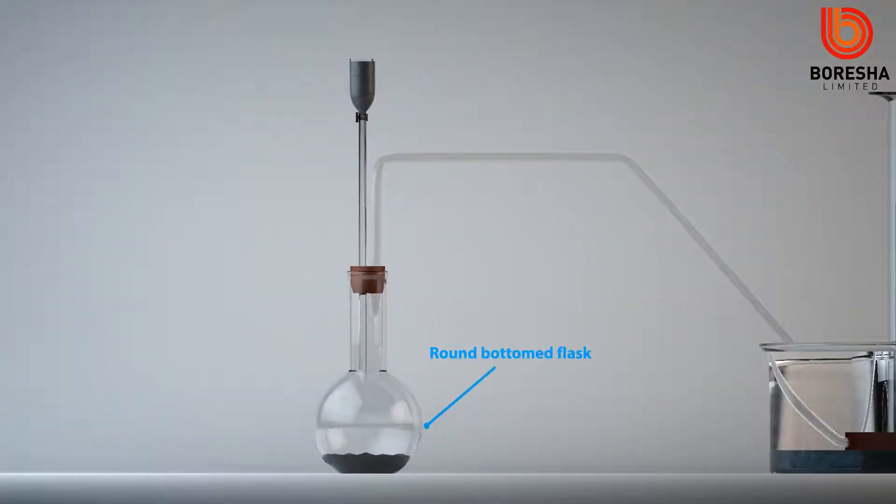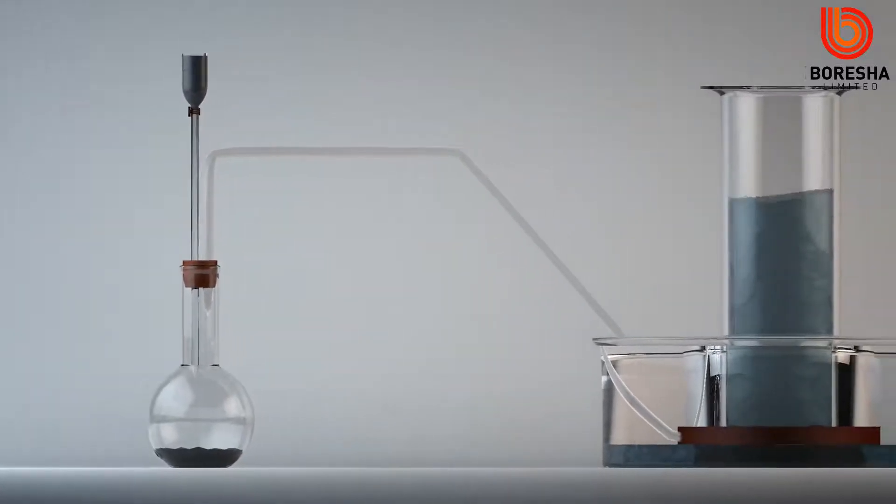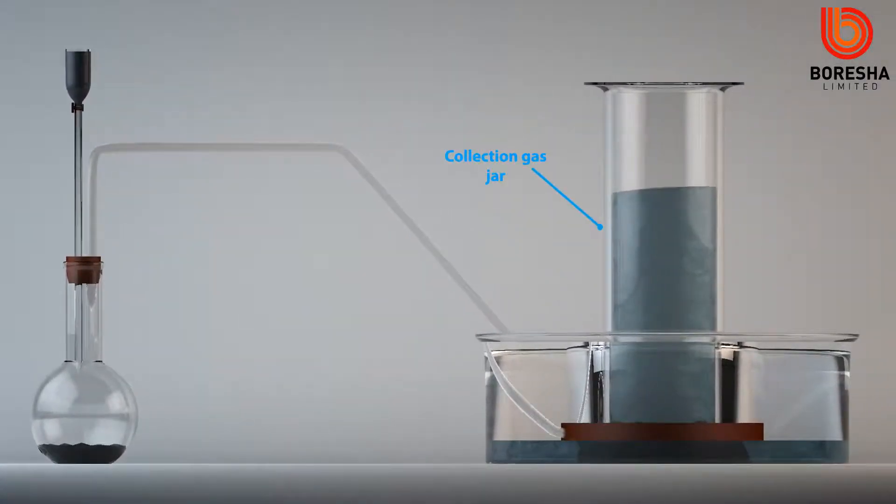Round bottomed flask in which there is a dropping funnel containing hydrogen peroxide and a delivery tube from the round bottomed flask into the collection gas jar passing through water.